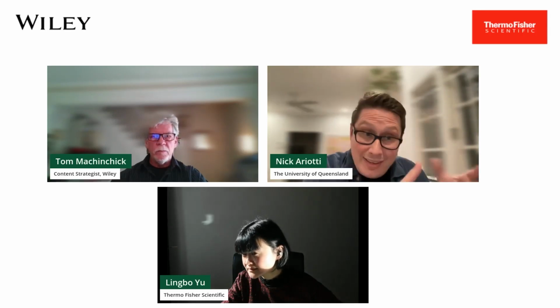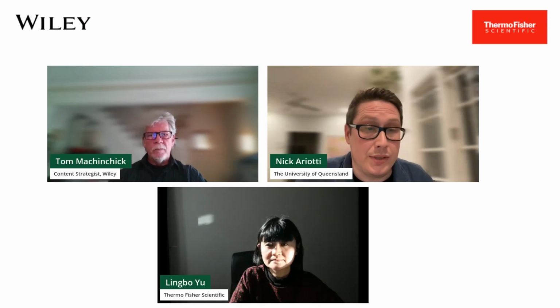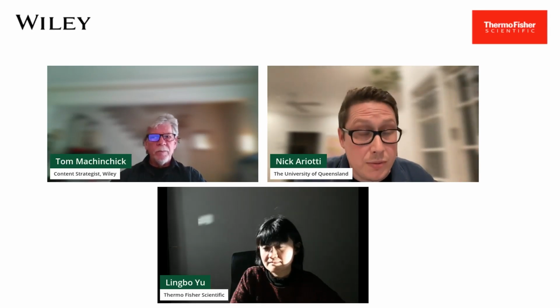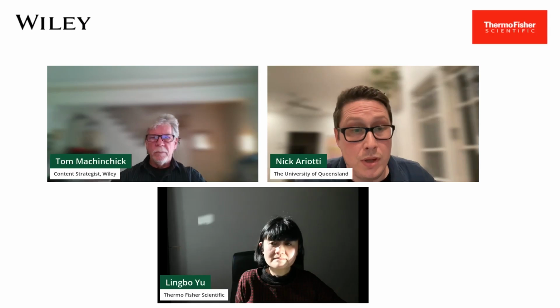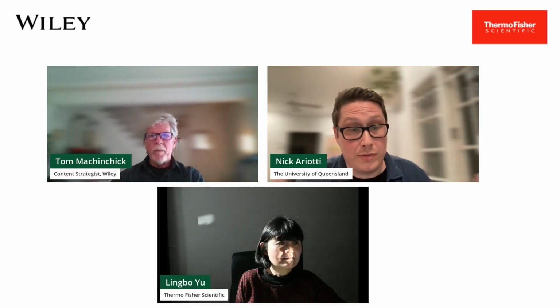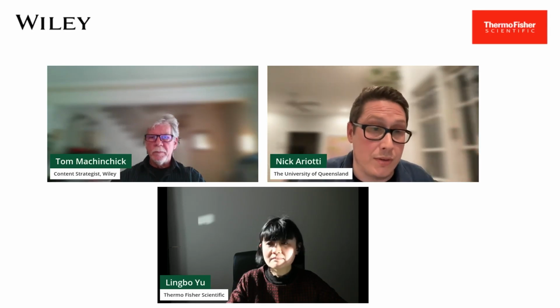We acquire our data on the microscope. We batch reconstruct in eTomo or IMOD. And this is really just about quality controlling our data. So we can reconstruct, we can screen those tomograms, to see which ones reconstruct well. Lingbo went through this in her talk. Which ones don't, we discard. Then we go through a second set of quality control, which is, do these contain our proteins of interest or not? Discard those that aren't relevant.